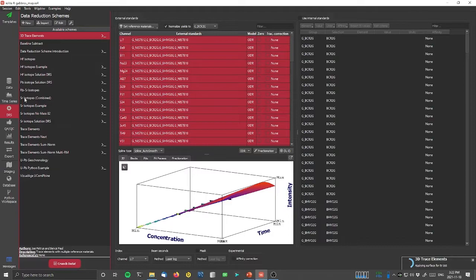We did that because we wanted to get as much sensitivity drift as we could. And we are measuring a lot of different channels. As you may have seen, there was about 50 channels. That said, it will run this first approach in about 20 seconds or so.